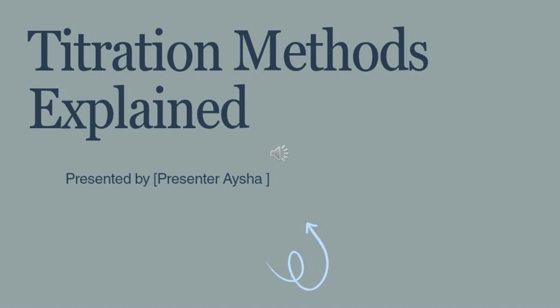Today our topic is titration, and in this presentation I will teach you what is titration, instruments used in titration, and the different types of methods used in titration.